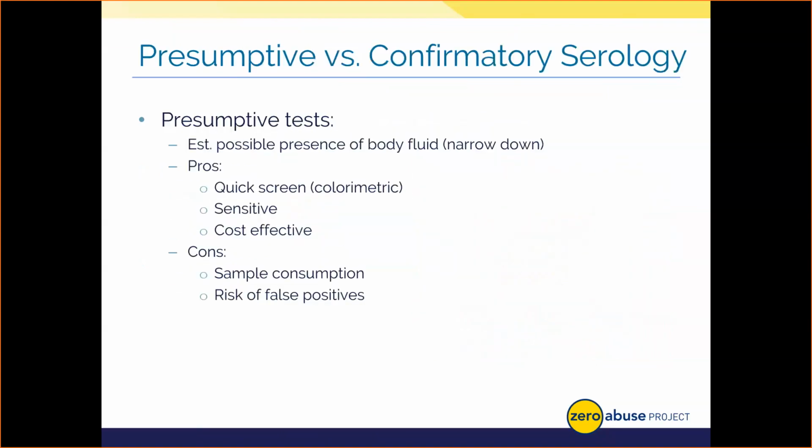Let's go ahead and dig into the two phases of testing for body fluids that may occur then in a forensic biology unit. As I mentioned earlier, presumptive tests are just screening tests. Typically, they're color change based and can rapidly, and I'm talking within a few seconds to minutes, tell you if a sample is possibly a body fluid. Now, this informs us as to what we should do next with that item, such as take it on to DNA or stop working on it if no body fluid is detected. It's advantageous to do this sort of testing because the cost of the reagents to test the item is really minimal. It's just cents on the dollar, making an easy investment budgetarily speaking.